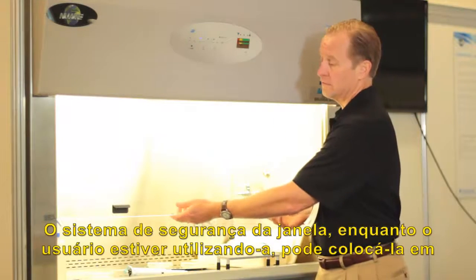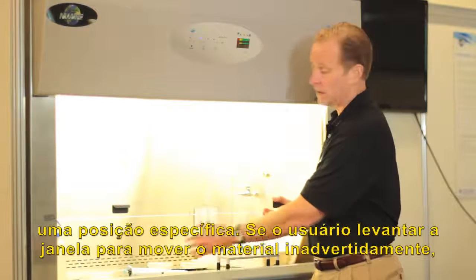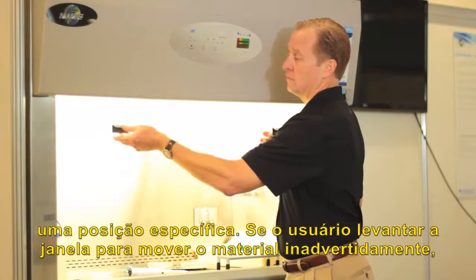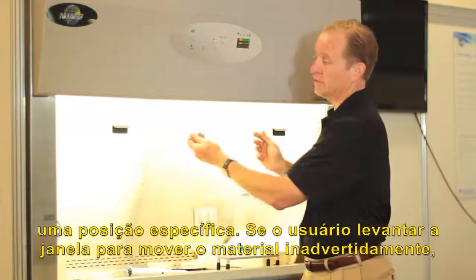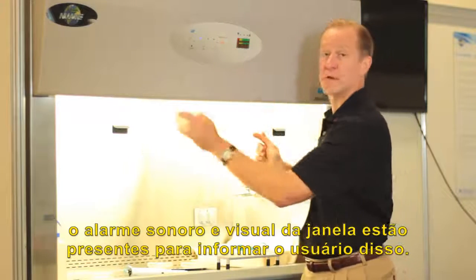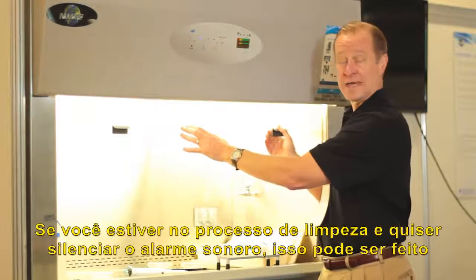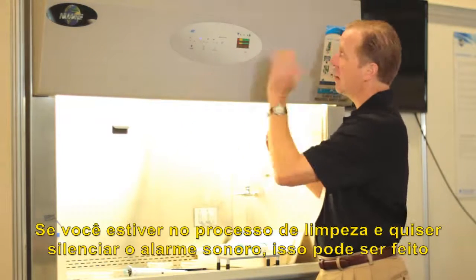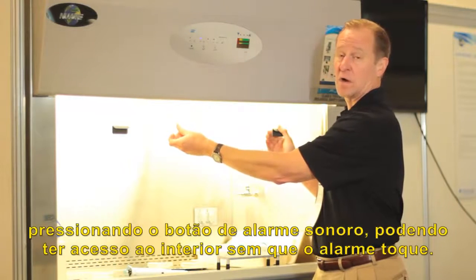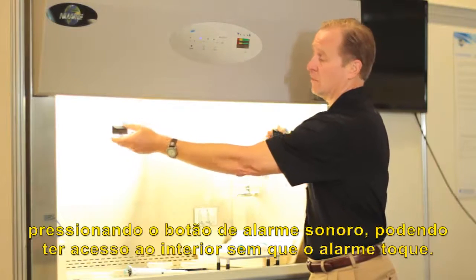The window safety system, as a user is using it, is specifically positioned to be in one location. If the user raises the window to move material in and out, or inadvertently, a safety alarm — both audible and visual — is present for the user to know this. If during the cleaning process they'd like to silence the audible alarm, they may do so by pressing the audible alarm cleaning key, so they can get in and clean the interior of the cabinet without an audible alarm.